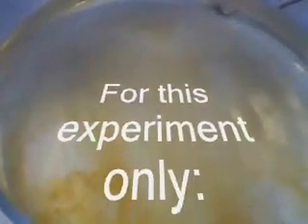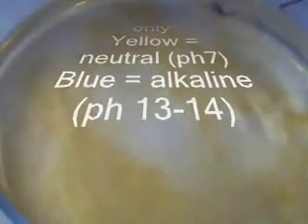But this universal indicator actually makes it look yellow. That's no problem, it's just a different kind of indicator. In this case, yellow means neutral — so normally we'd be looking at green water here. Now group one metals are, of course, called the alkaline metals because they can make water alkaline.